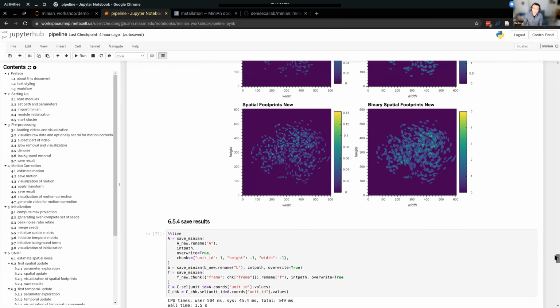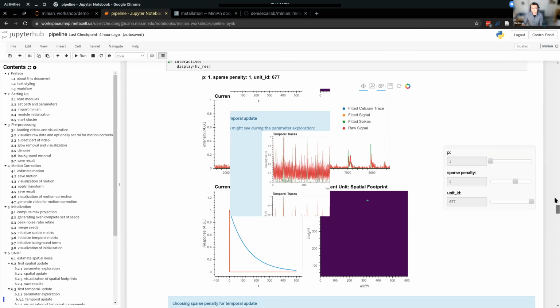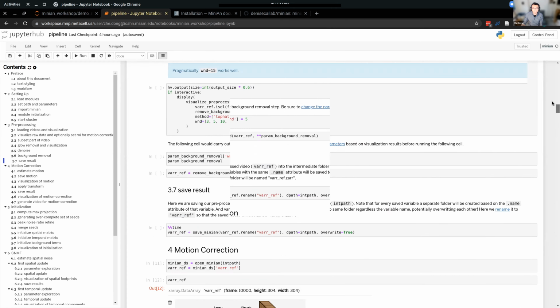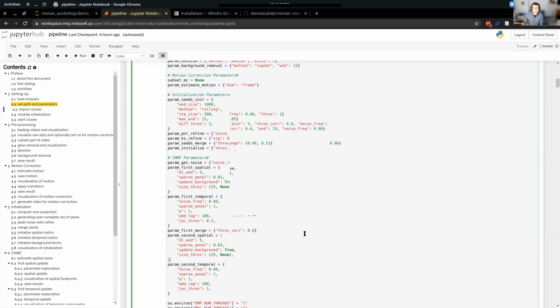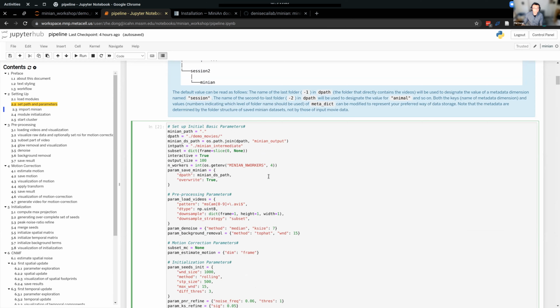But the real problem, at least when I was doing batch processing with Papermill, is that when I define the parameter block, the last time I tried it, it only supports JSON or I think YAML. Anyway, the parameter has to be serializable.